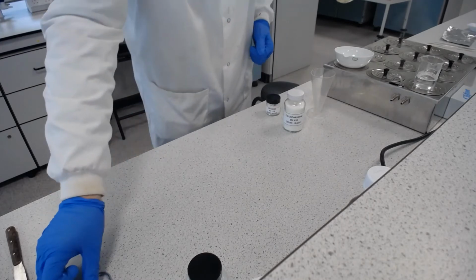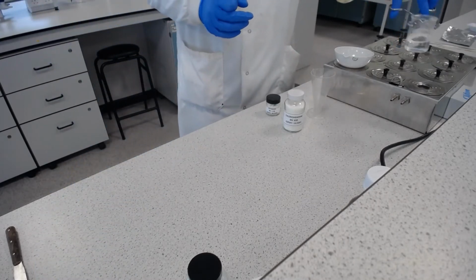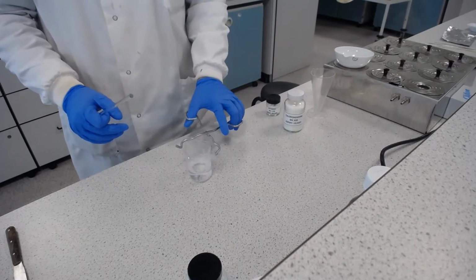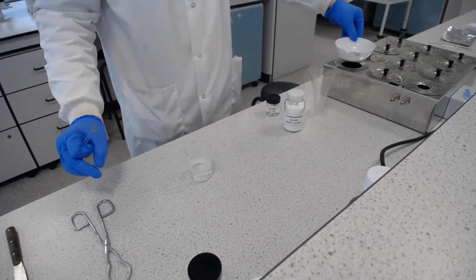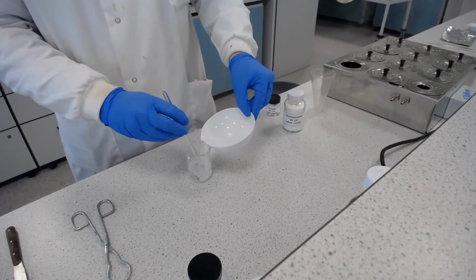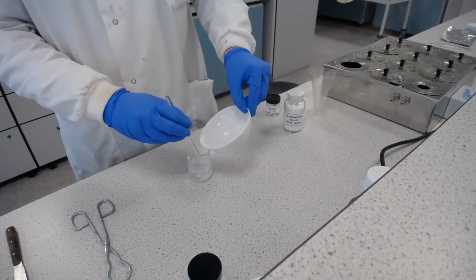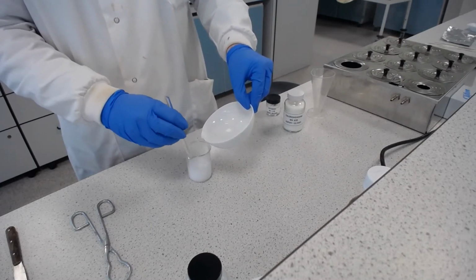So I'm going to take my aqueous phase off, and I'm pretty confident I'll be able to hold the evaporating dish. I will. And whilst I'm already stirring, I'm going to start adding that in there.